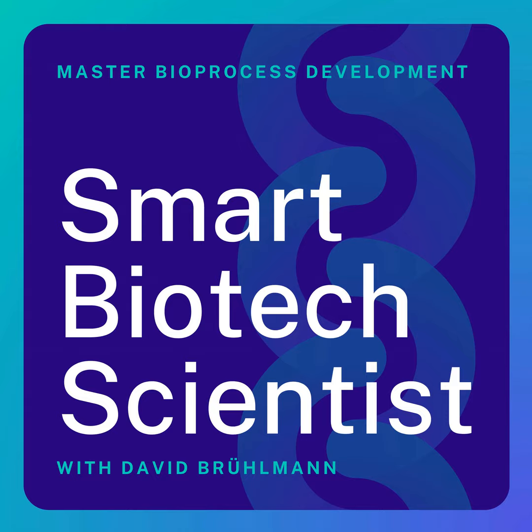Fantastic. So let's start with the beginning. Could you explain what a seed train is and why cell expansion is such a critical part of biologics manufacturing? Seed train is quite a simple process. You have to expand the cells from a working cell bank, where you usually start at 30 milliliters, up to a large-scale production bioreactor that can be between 1,000 and 20,000 liters. So at each step, the cells are transferred from one step to the other. The key reason to do that is to keep the cells in their logarithmic growing phase.